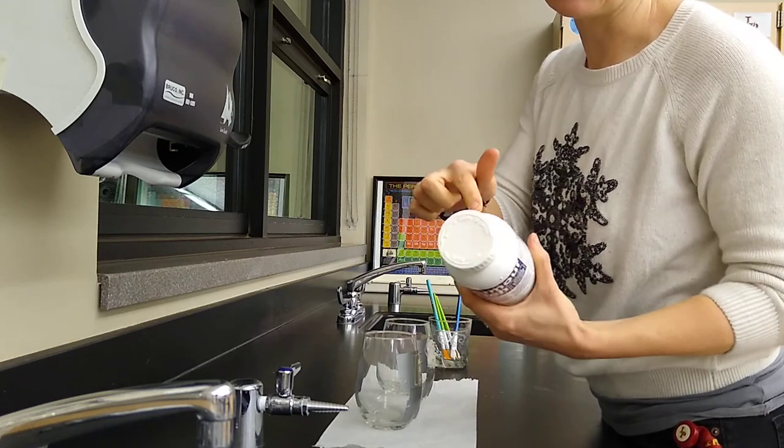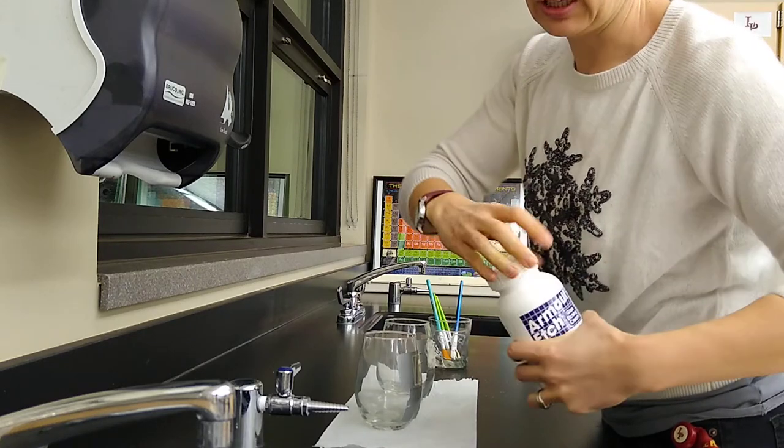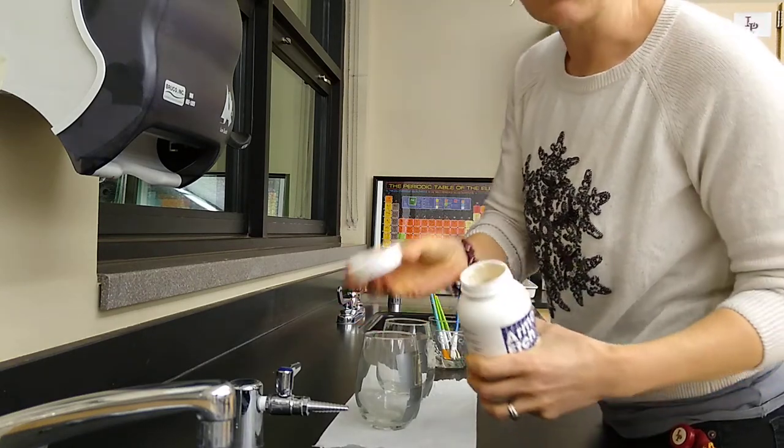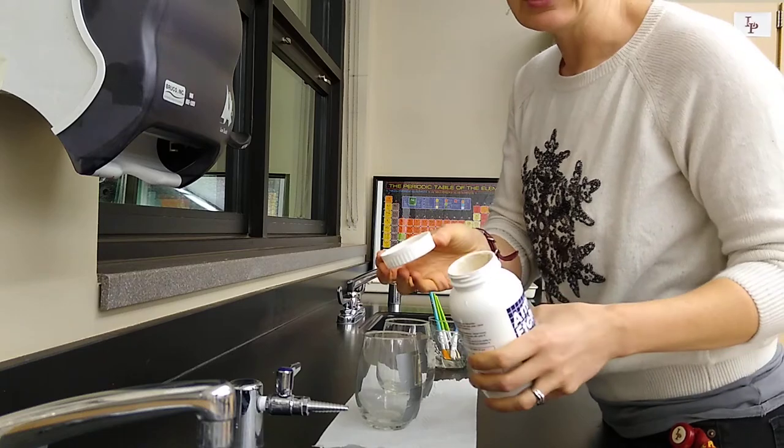What you're going to need to do is open it. It's got one of those child lids so you'll have to push and twist to open that up. When you're done, please put the lid back on tightly so that it won't dry out and we can use it again.